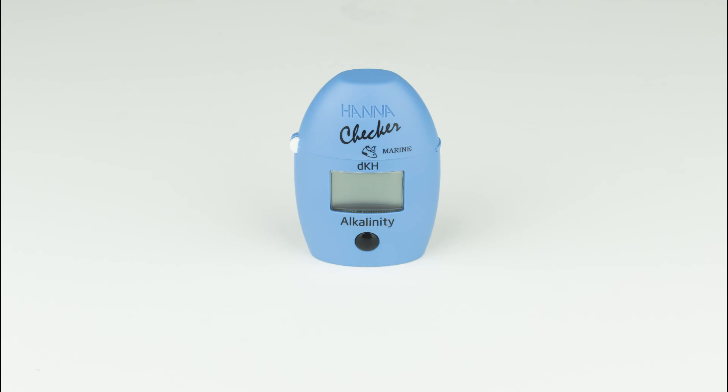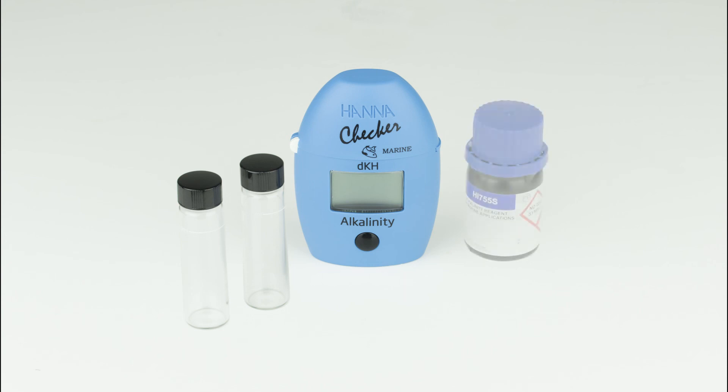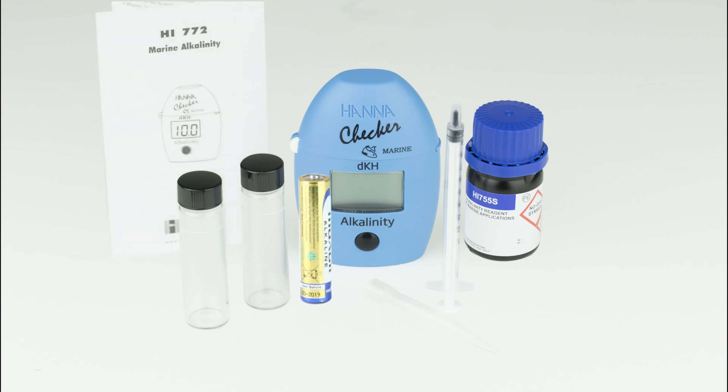The HI-772 kit comes with everything you need to begin testing: 2 sample cuvettes with caps, seawater alkalinity reagent starter kit, 1 ml syringe with tip, and AAA battery.